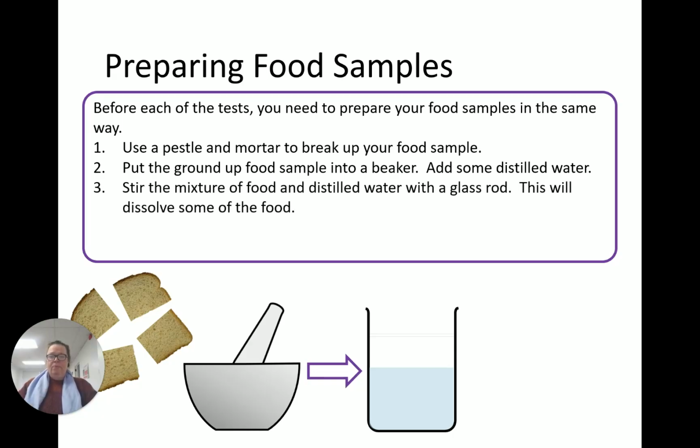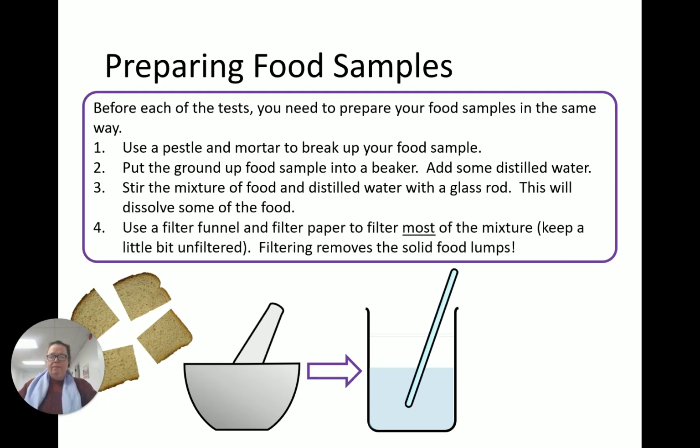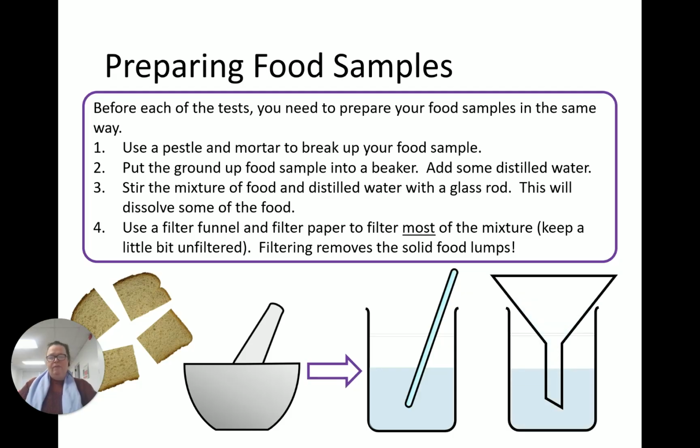Edexcel want this one, which is filter. Okay, and then just use the liquid. So everyone, including Edexcel, if you just learn 1 and 2, there's plenty of other marking points. So break up in a pestle and mortar, put in some water and stir. Now, you only have to do one lot of preparation because what you've made there, you can use for all of the tests. All right, so let's have a look at one at a time. So there's the extra filter bit. You can put it in if you want to, but it's not always a marking point in all of the exam boards.